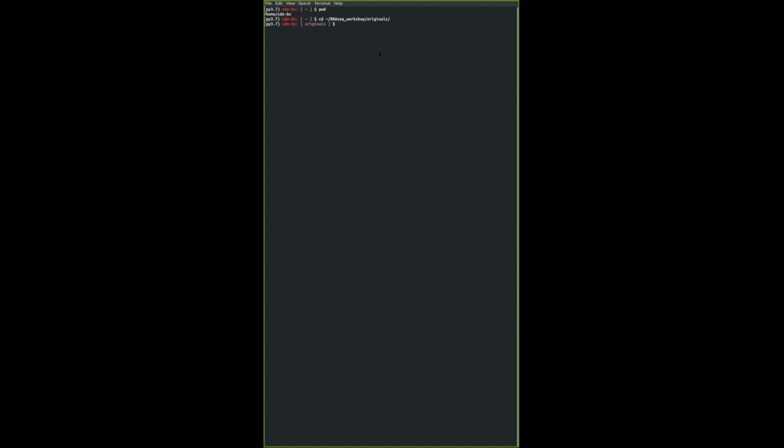We can also list the files that we have in this directory. So ls is the function to list files. I like to use the -l flag because -l will give a little bit better list of your files with several other information. So in this directory, there is a fastq folder together with this index file called transcriptome.idx, which I hope you have downloaded. I think I gave it through an email link. So for those who have not, try to do that before the break, because this will be used in the second half of today's session.